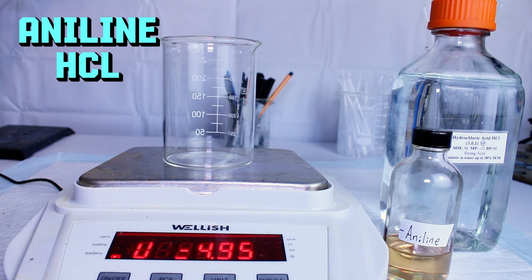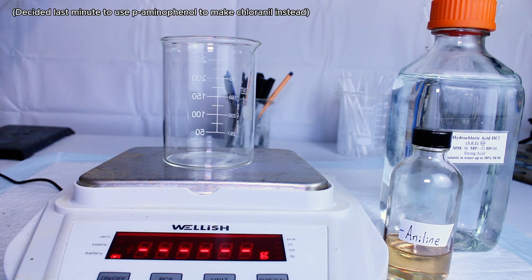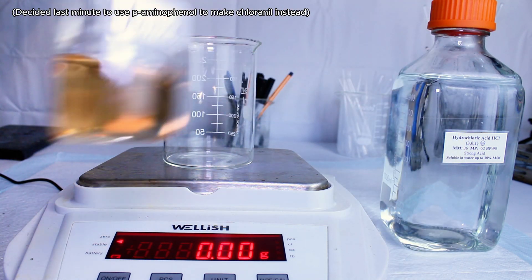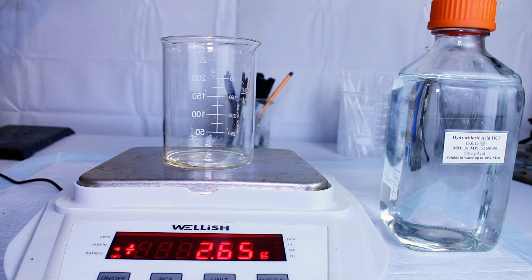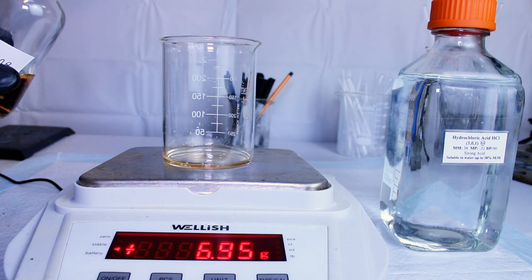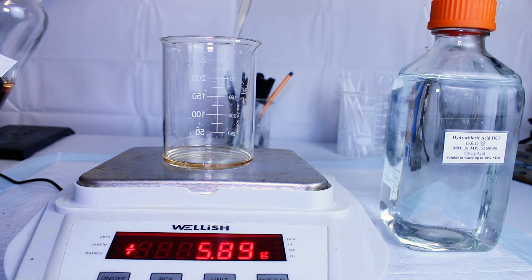Today I'm going to make the chemical aniline hydrochloride, which I plan to use later to synthesize chloranil. Chloranil can then be condensed with more aniline to yield the synthetic organic pigment dioxazine violet, which has been on my radar for a while now.